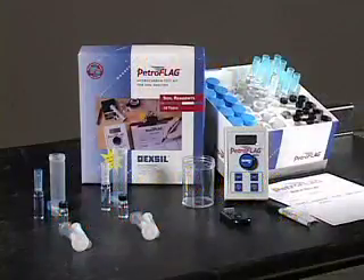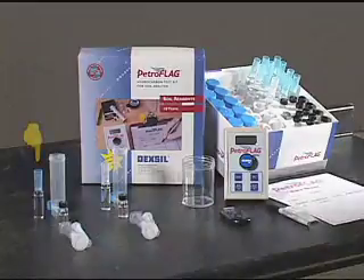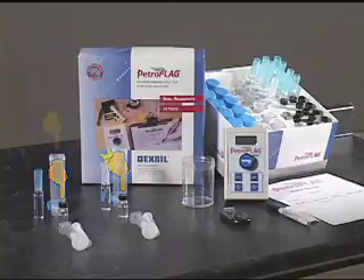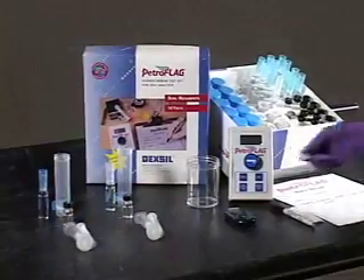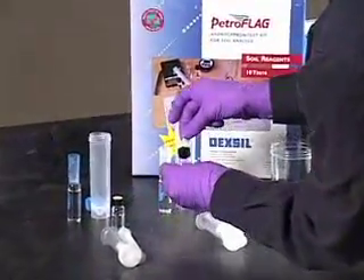Included in each box of 10 PetroFlag reagents is one set of calibration solutions. To perform the calibration, find and set aside the following components: one reagent blank — use any of the blue capped extract vials; one 1,000 parts per million calibration standard — glass vial with white cap; two black capped vials containing developer solution; two plastic soil tubes; two filter syringes and plungers. Remove the plungers from the soil tubes. And the timer. Using the round labels provided, write BL on one and CSD on another. Affix the labels to the caps of the developer vials.